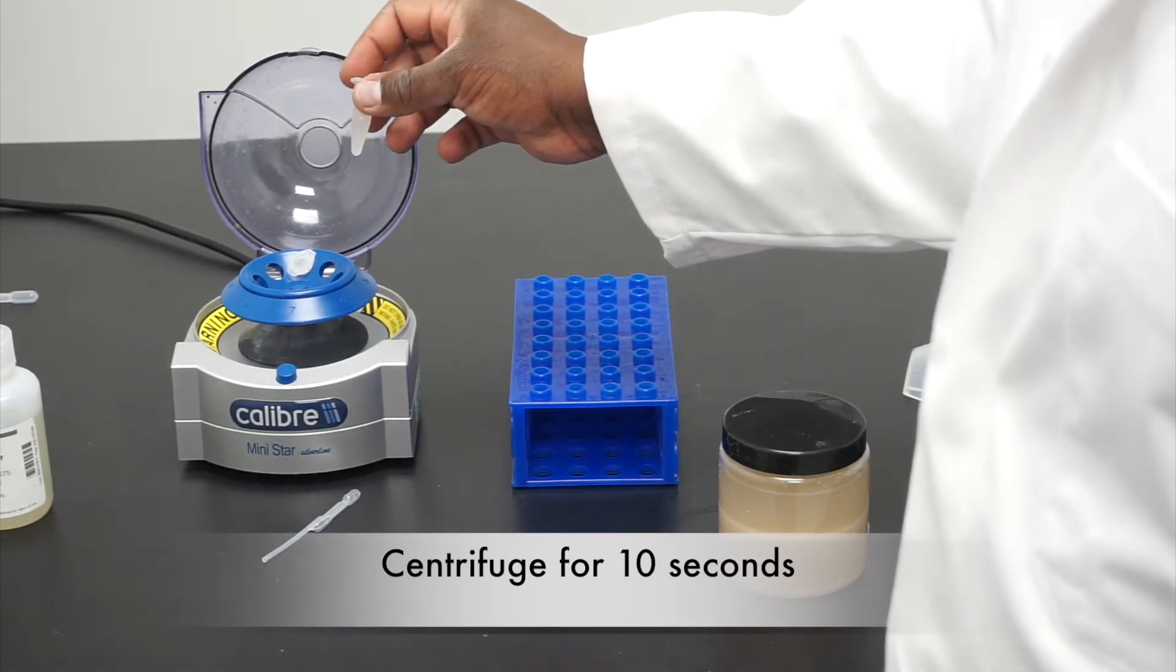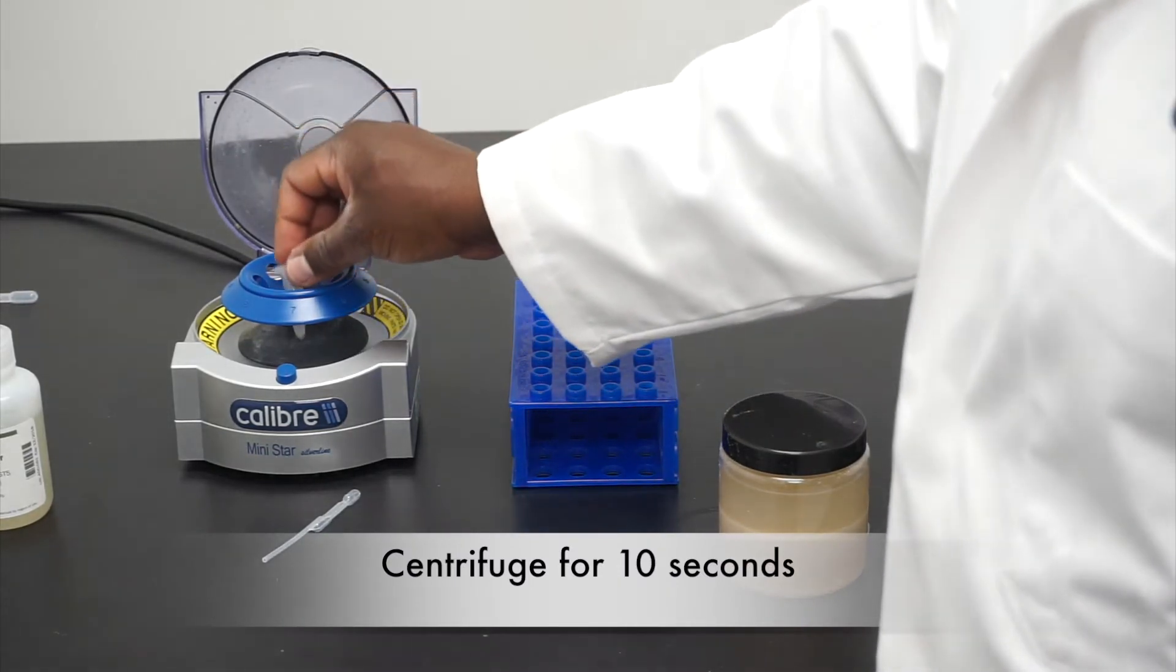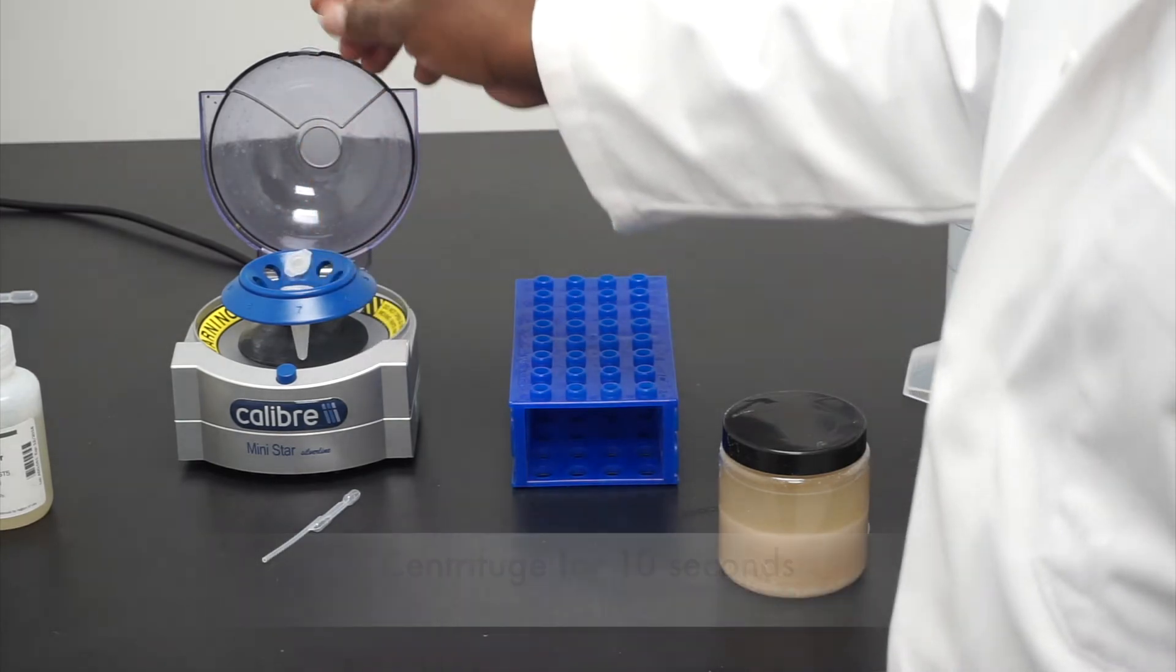Place your microcentrifuge tube into your centrifuge and allow it to spin for 10 seconds.